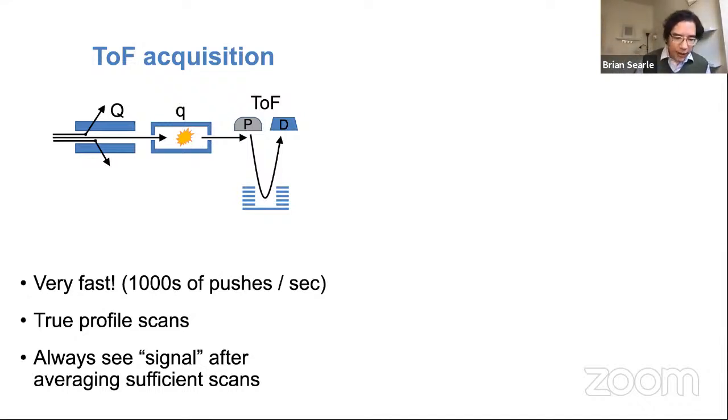So to understand how you set up a DIA experiment, you actually have to go back and think about how an instrument works. A lot of the DIA experiments were originally designed for TOFs, because TOFs have a lot of the same characteristics as triple quads. So one advantage here is that rather than having a QQQ, you actually have a QQ-TOF, right?